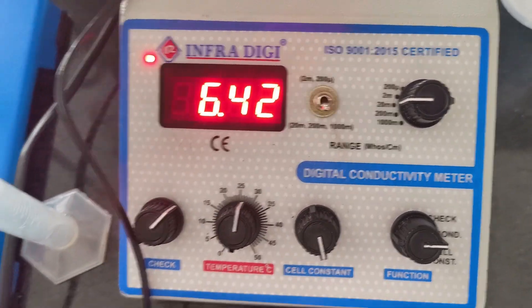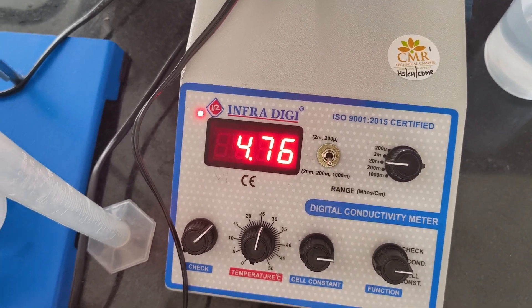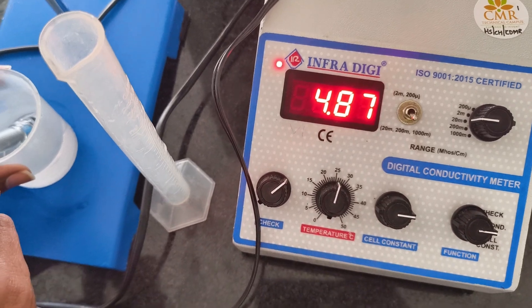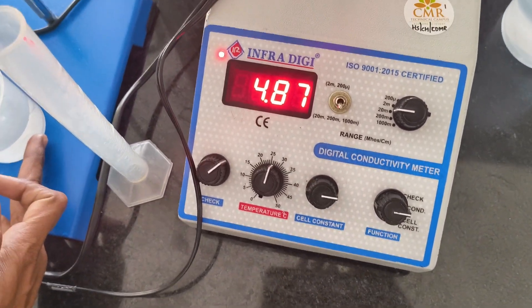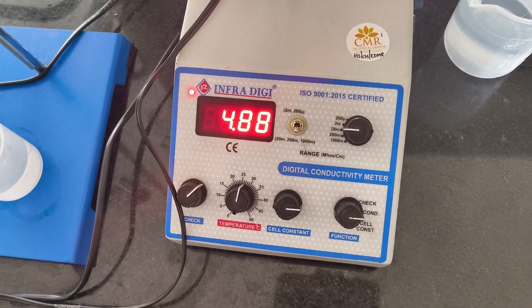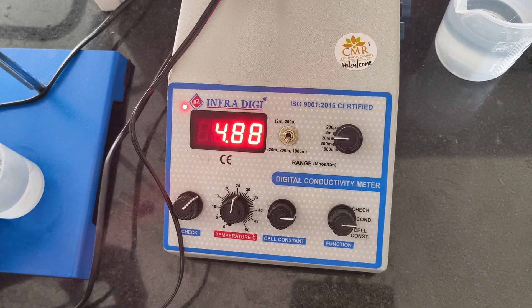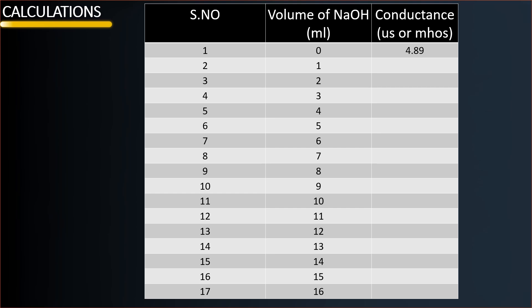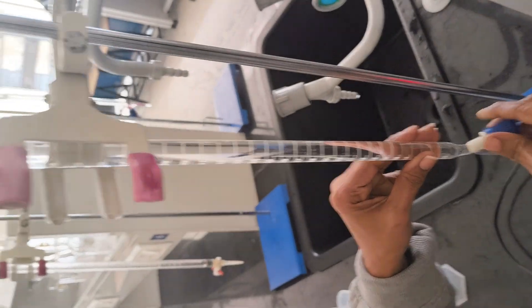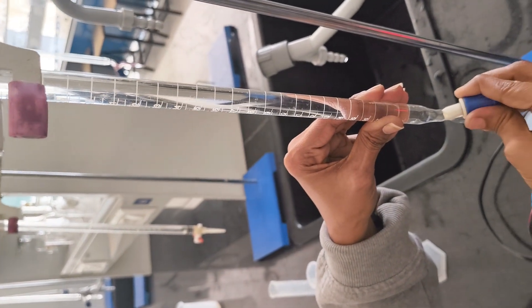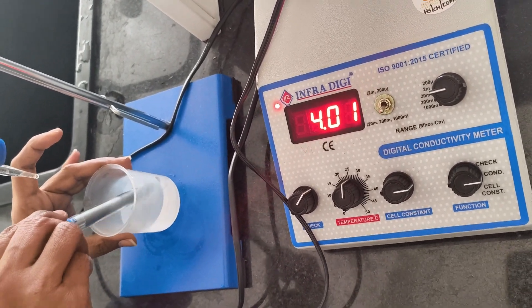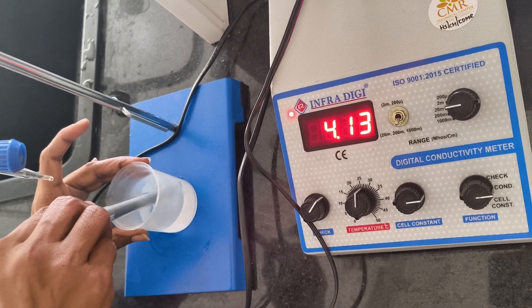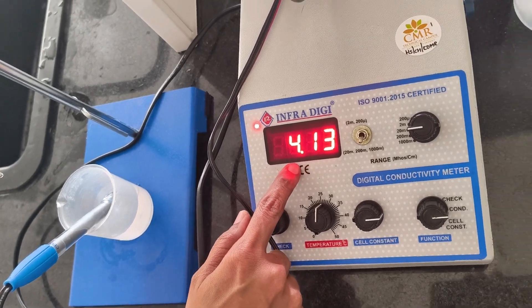The conductivity cell should be dipped into the HCl solution and conductance values noted from the digital conductivity meter. Since this is a strong acid HCl, you will get a high conductance value due to H⁺ ions. Then we have to add NaOH from the buret — fill the buret with NaOH up to the mark and add 1 ml of NaOH from the buret into the HCl solution. Dissolve it and note the change in the conductance value.